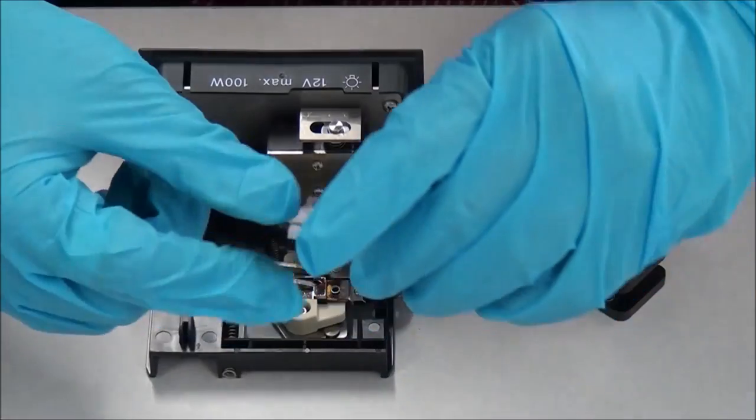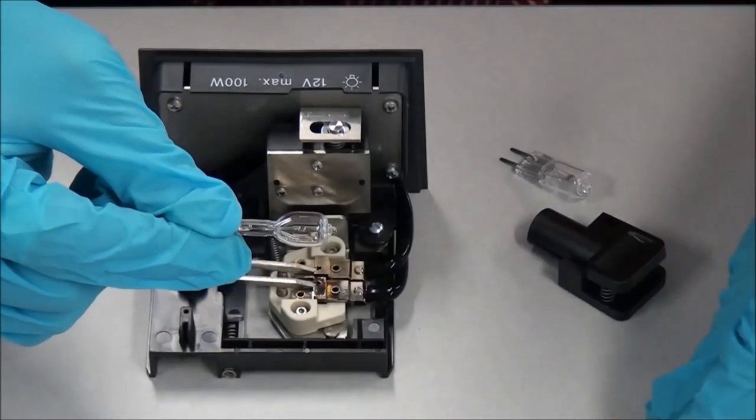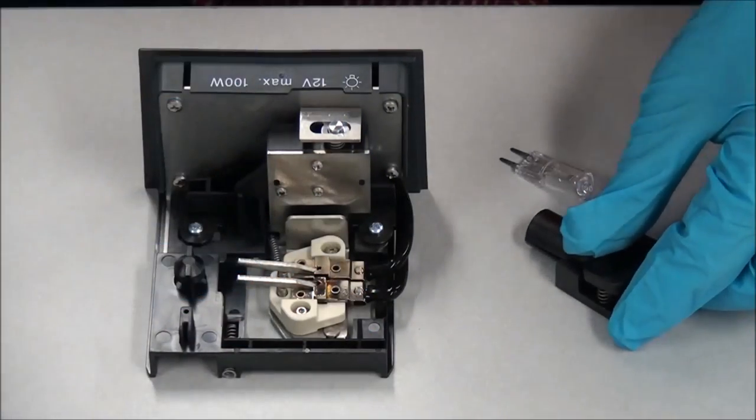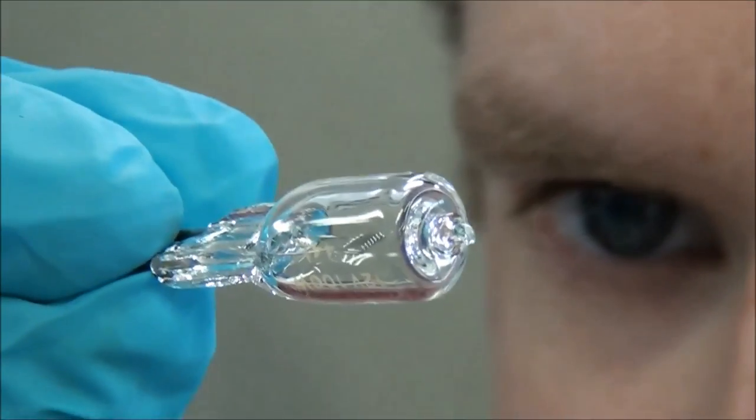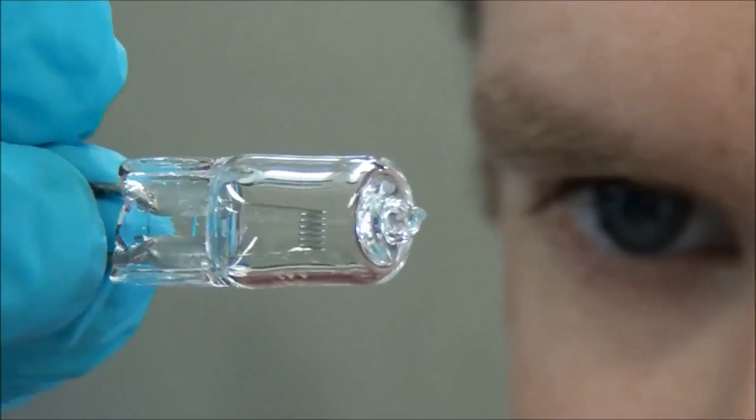Pick up the new bulb using a glove or lens paper to prevent finger oils from transferring to the glass. Finger oils can reduce the bulb's lifespan. You may want to visually inspect the new bulb.